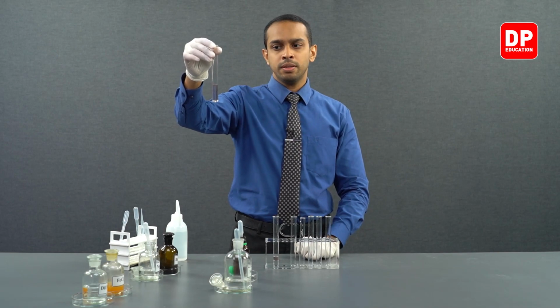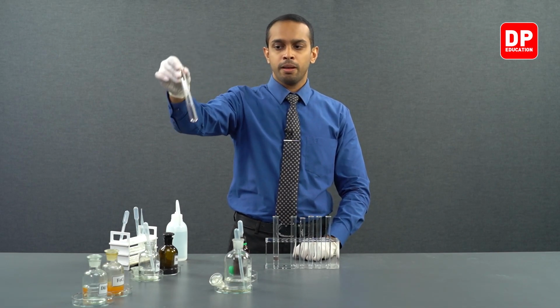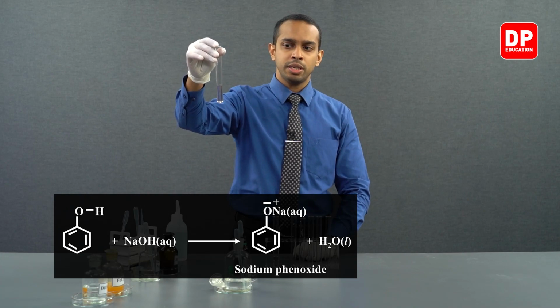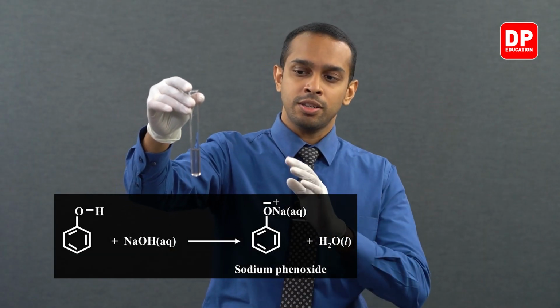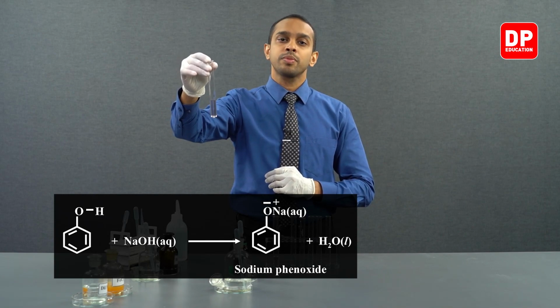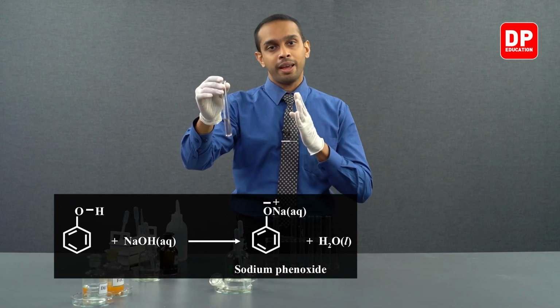When you added just water, we saw a layer separation, but when we added sodium hydroxide and mixed it, we saw the layer separation ceases to exist and the phenol dissolves well in sodium hydroxide. The reason for this is the reaction that takes place between phenol and sodium hydroxide.